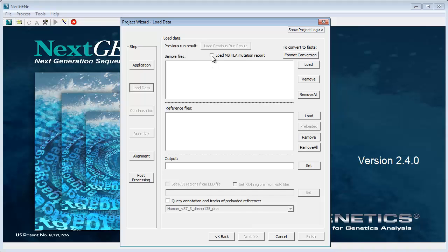Otherwise, under Sample Files, you can load your files in FASTA or BAM format. If needed, for FASTA files for example, click Format Conversion to open the Format Conversion tool to convert your files to FASTA format.